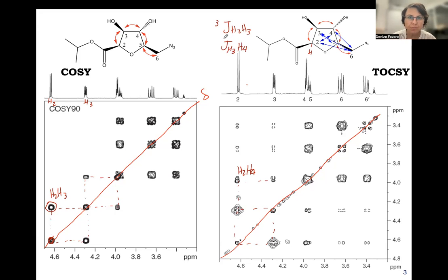Okay. So I'm going to now move on to the TopSpin.